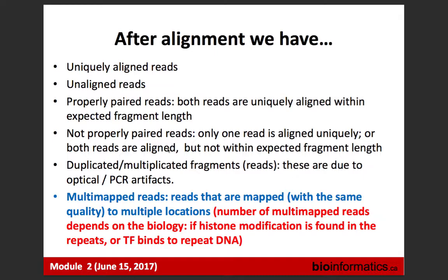Start to end, the exact same sequence. That's right. Yes, exact same coordinates. With sequence, the read sequence can differ slightly, because it's PCR, prior to sequencing, so we can have sequencing error. So the sequence itself can be slightly different, but there is a very strict requirement that sequence similarity is also high.